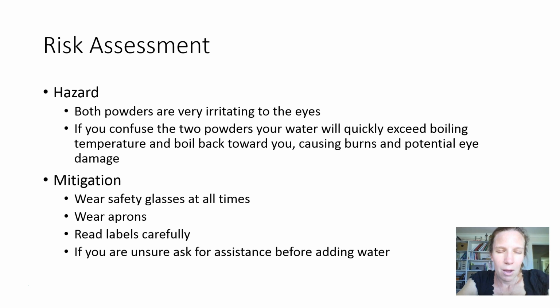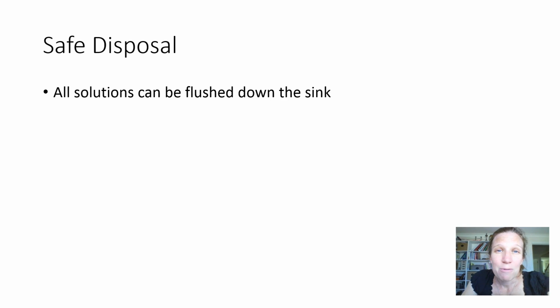So it's important, I say again, that you wear safety glasses at all times. Also, in this case, I'm going to ask you to wear an apron, because if it were, God forbid, to splash back onto you, I'd like you to have an apron to absorb some of that heat. You need to read the labels in this practical activity very, very carefully. And if you're feeling insecure or uncertain, you need to ask me for assistance before you add water to anything, so that we can be sure that nobody suffers any burns. As for safe disposal, everything here can be flushed down the sink when you're finished with it.